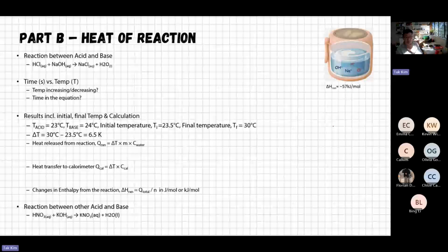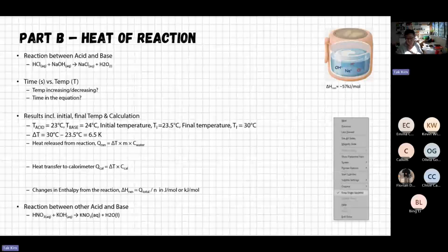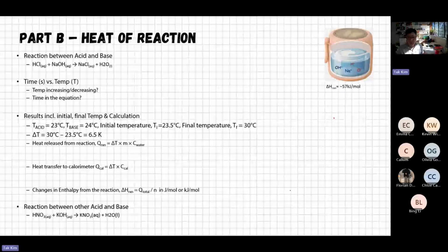Okay, now the next one is when we observe the temperature increasing, so an exothermic reaction. Okay, now let's use blue color. Right. So it'll be pretty much the same process, except the calculation is a little bit different because you need to find out the enthalpy changes.